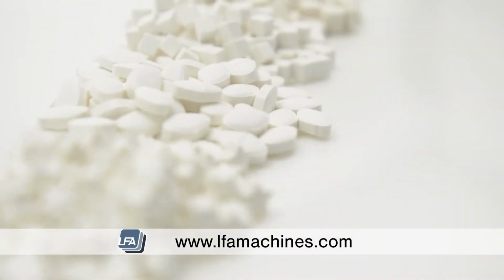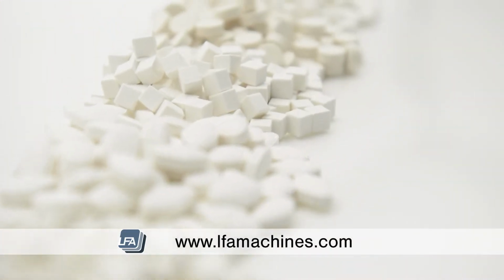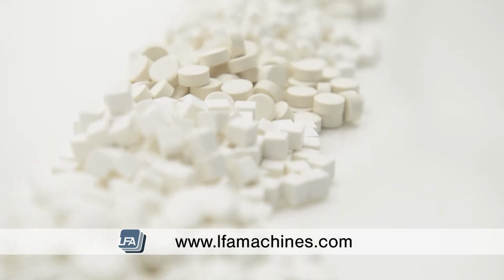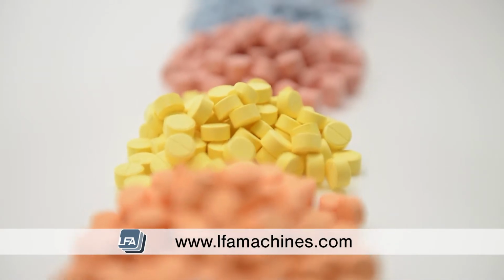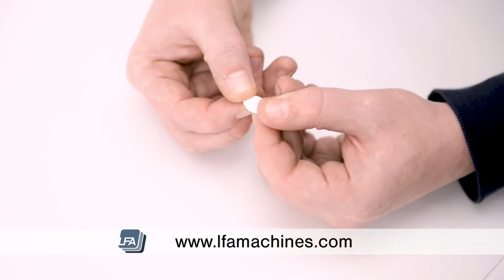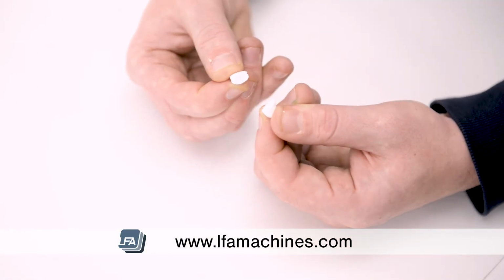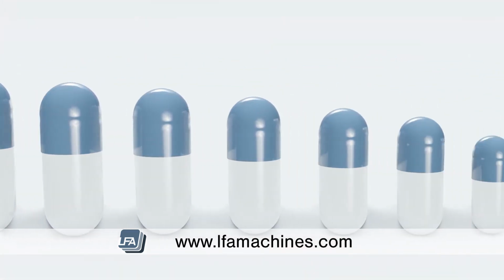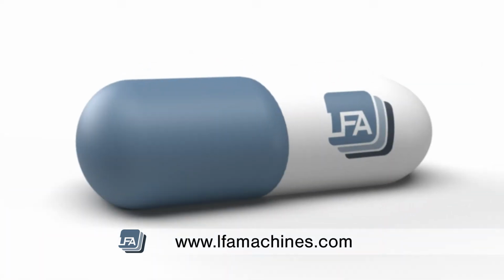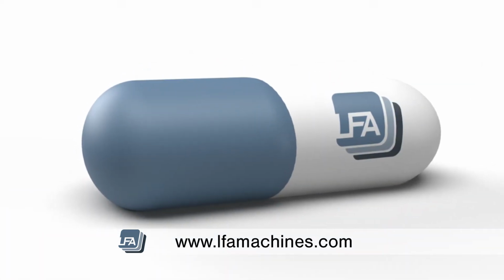Tablets are widely accepted by consumers. They have been around longer than capsules, making them more popular. They can be made into different sizes, shapes, colours, embossed, and can also have breaker lines so the consumer can split their dosage in half or even quadrants. Capsules do have different sizes and colours, but these are fixed to 10 standard sizes. Capsules can be printed on, but this puts up the cost per capsule considerably.